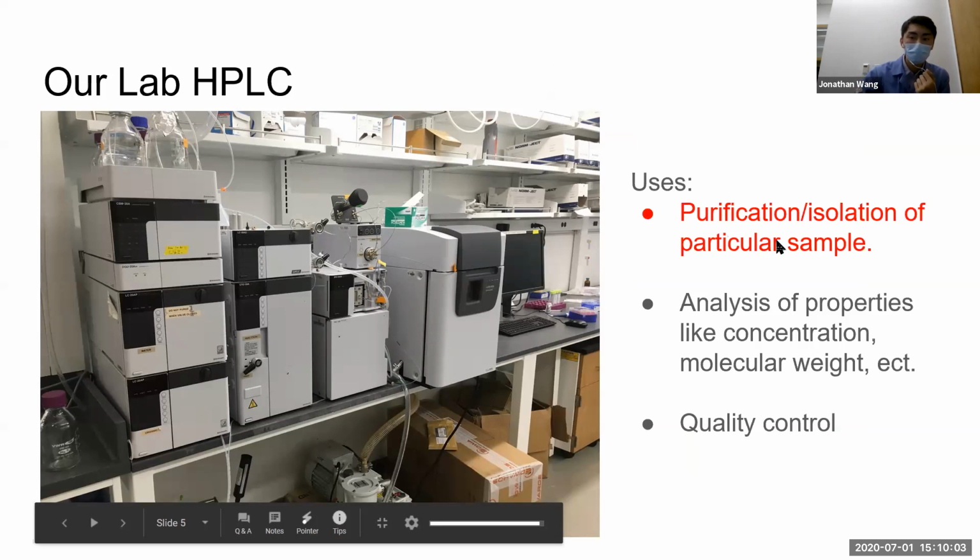We can purify or isolate some particular chemical in a sample, and analyze its properties, like the concentration you have in the sample, molecular weight, and other properties like that. And finally, as I said earlier, quality control of different pharmaceuticals.